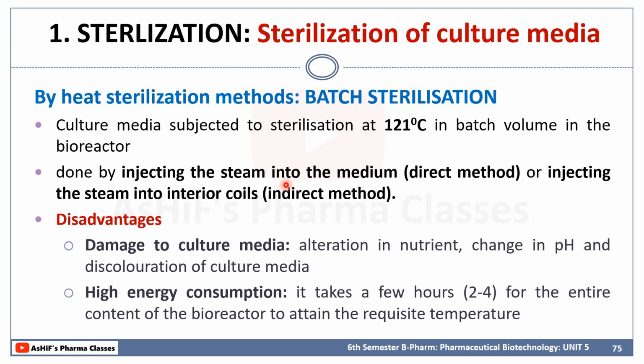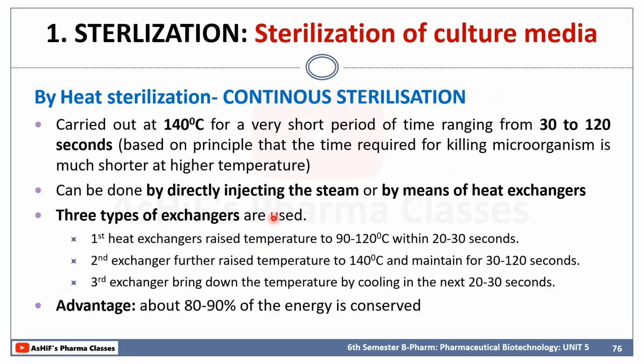So these are the batch sterilization processes, but there are some disadvantages. It may damage the culture media, and high energy consumption is required. So these are the disadvantages of batch sterilization.